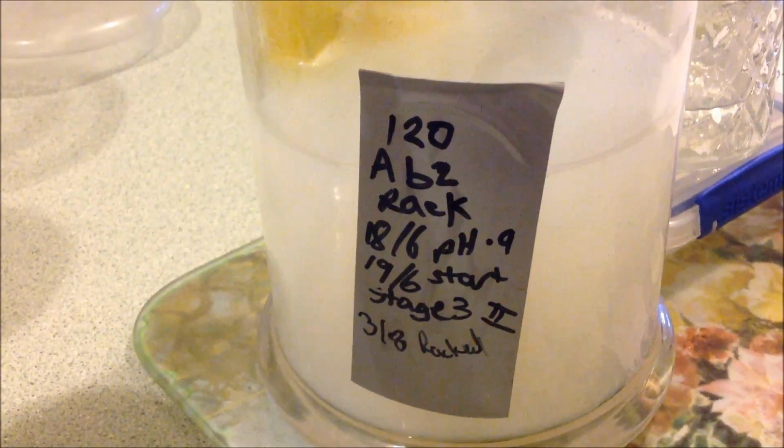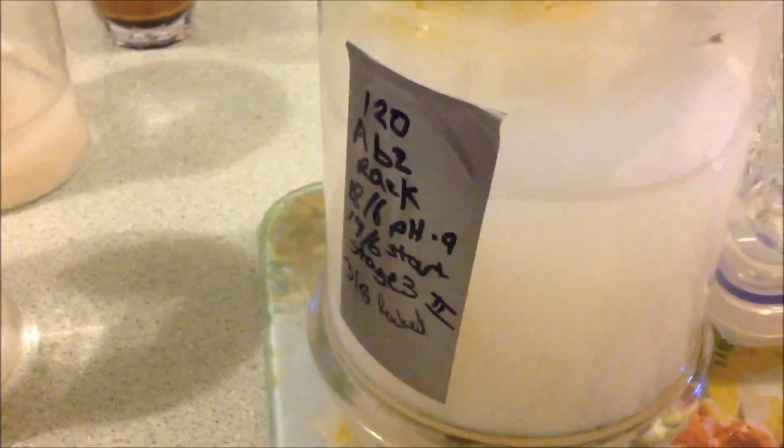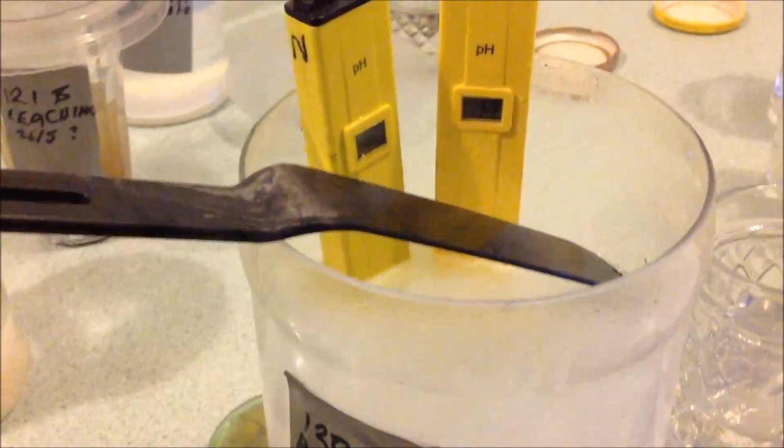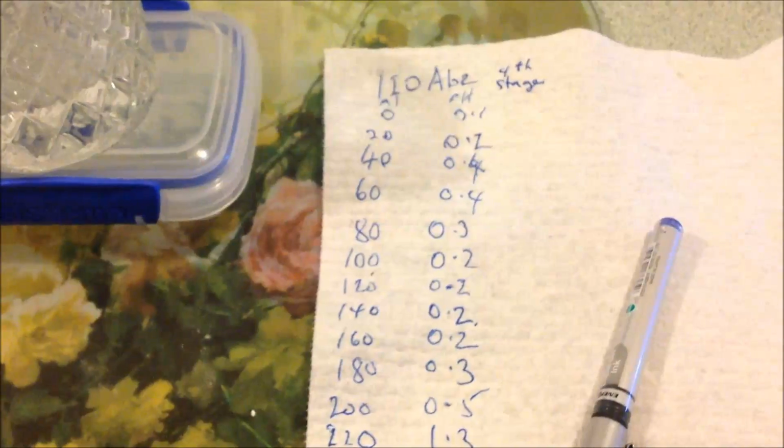Bring 120 AB racked off at pH less than 1, and just bringing it back up now. We're about 1.3. Notice it's cloudy already, which is not all that unusual. Usual sodium hydroxide concentration. So there you have it. I've got 220 ml in already. For some reason the pH went all the way down to 0.1.